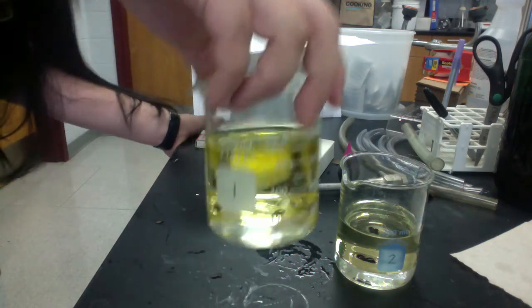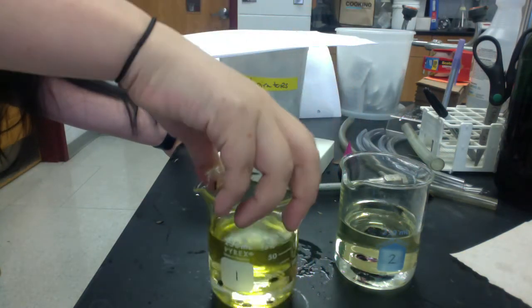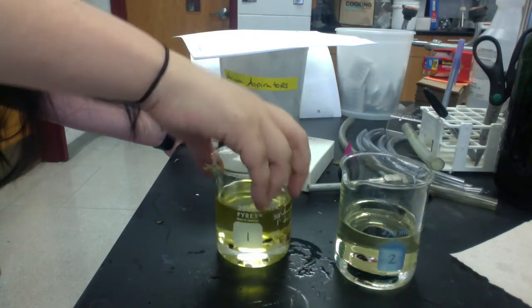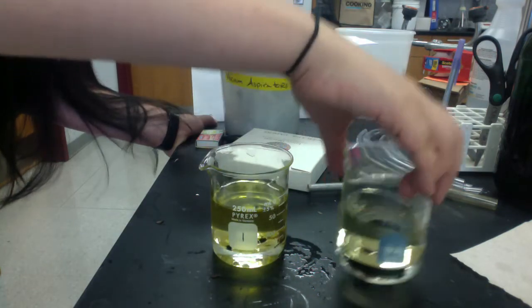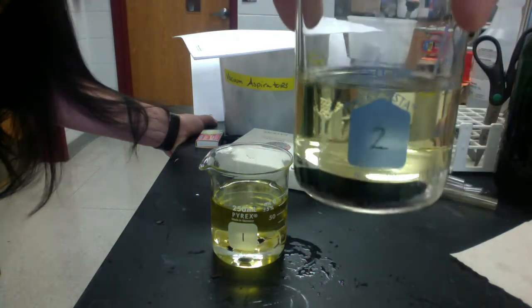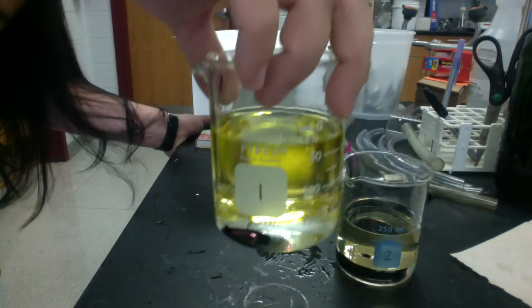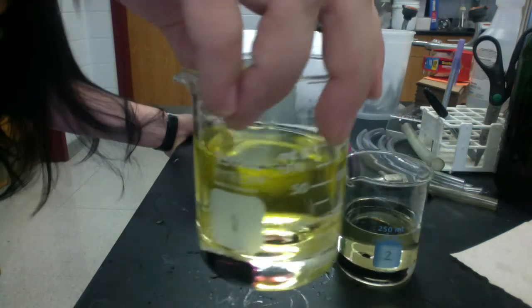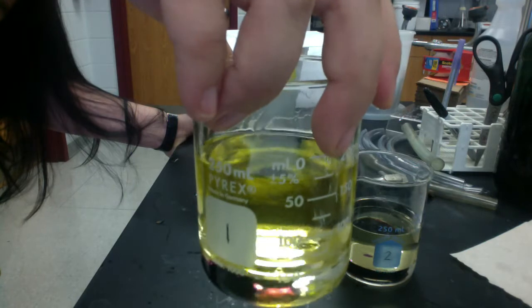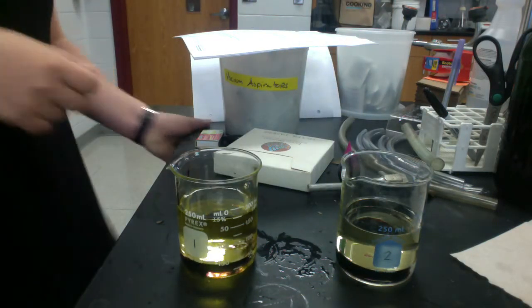All right, so let's see. I'm going to shake this around a little bit and see if anything changes. Oh, check out beaker number 2. This does not have olive oil. Oh, and number 1 finally started dropping. Interesting.